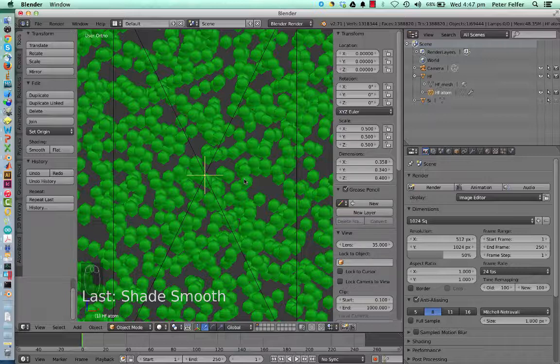Yeah, and that's it. That's it for this tutorial. And the next tutorial, we're going to dive a little bit into animation.